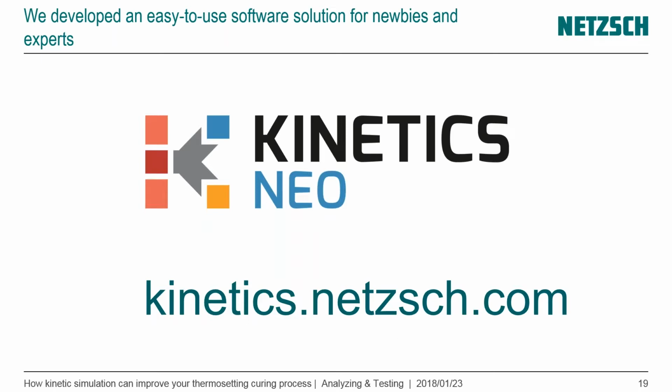So I have the following question from Damike. I have calculated Avrami exponent and activation energy, but it showed large difference depending on the heating rate. And another question: I am working with benzoxazine resin, and the problem is its high cure temperature. Is there anybody who can help me with some accelerator additives? 2 questions from 2 different people. Sorry for that. Okay, first, Damike.